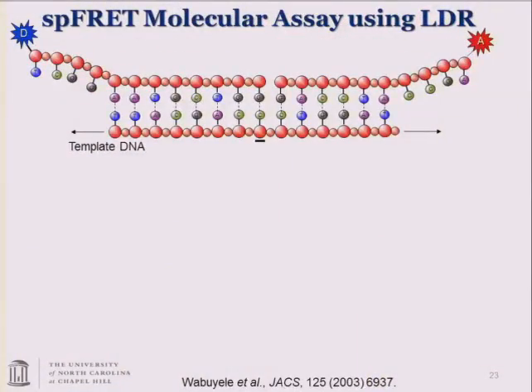All right, now the assay. This is really important too, because what we need to do is to recognize certain mRNA transcripts that have been pulled out of this sample. And the way we do that is using a reporter sequence within that particular transcript. So we have 2 oligonucleotide primers, this is the cDNA, that recognize that reporter sequence.